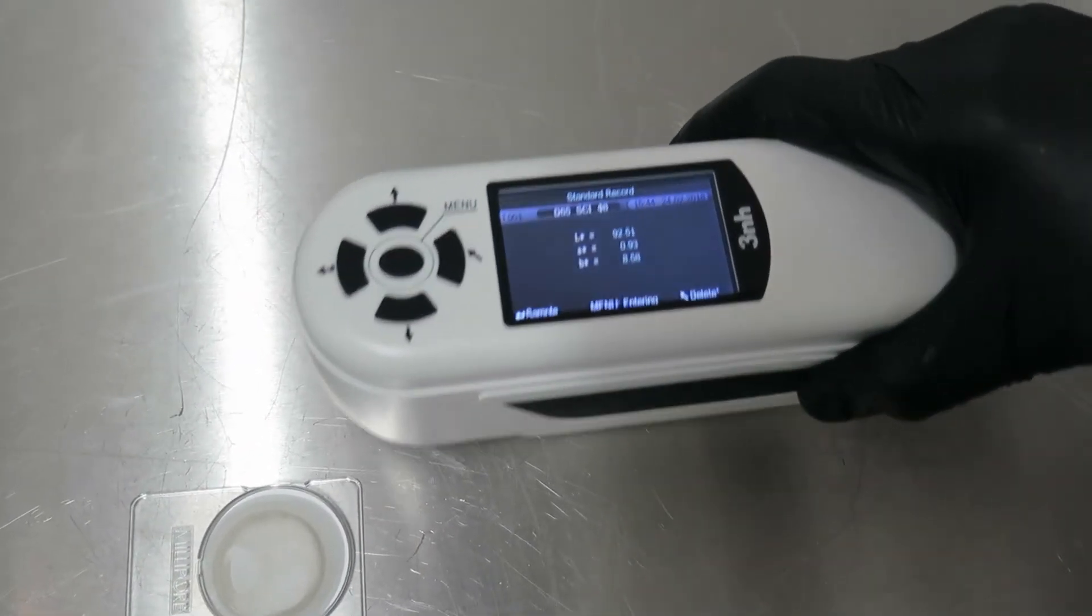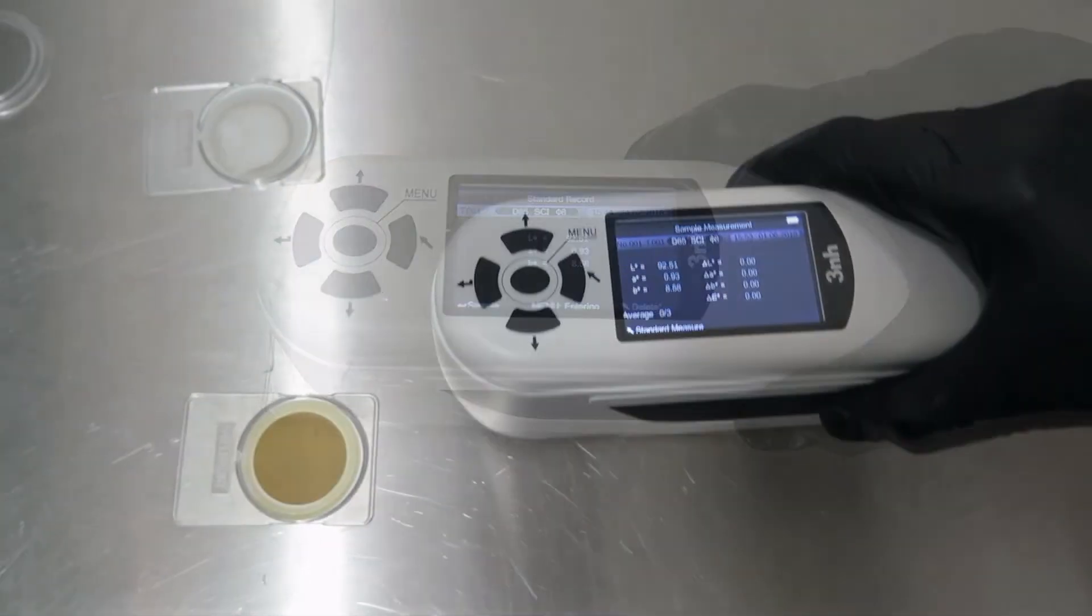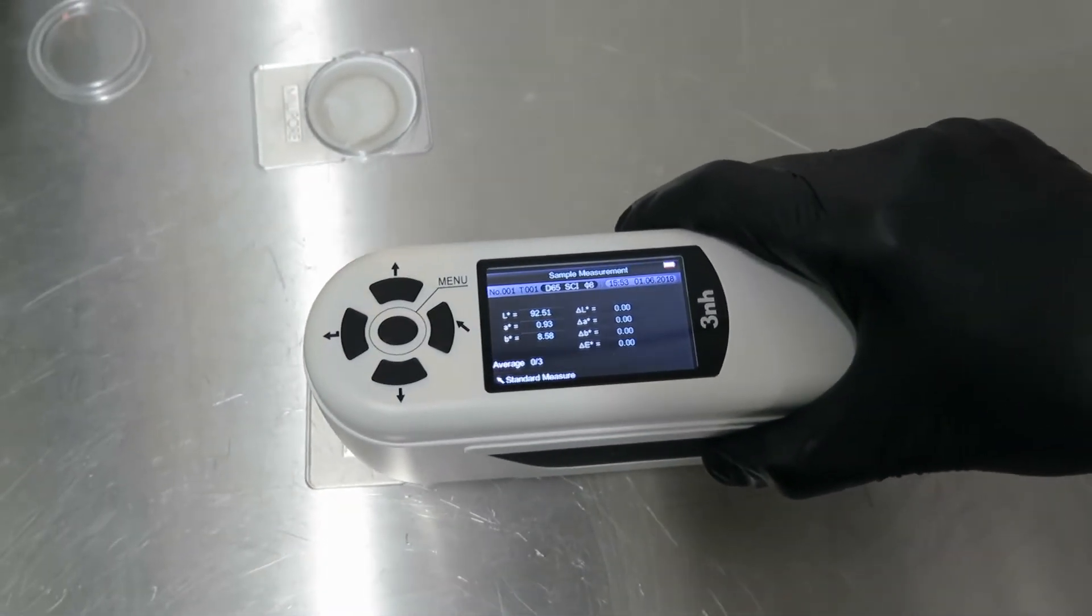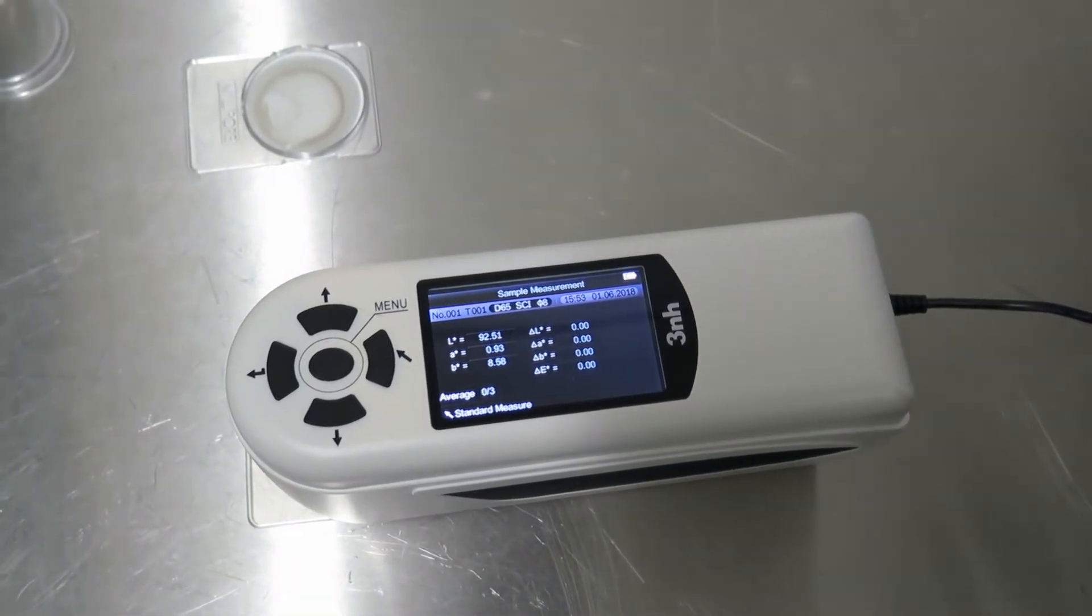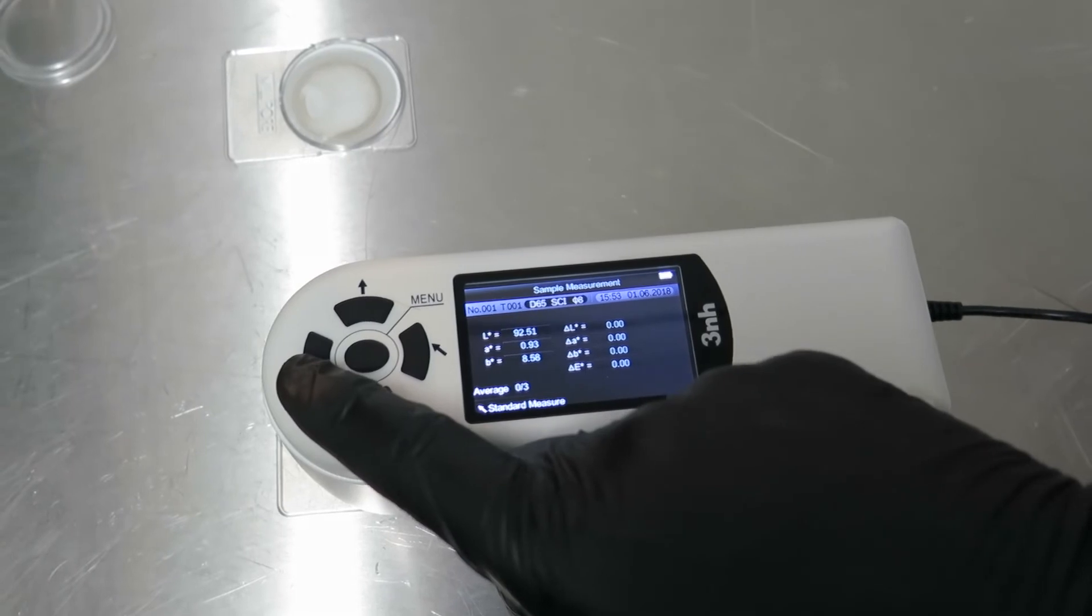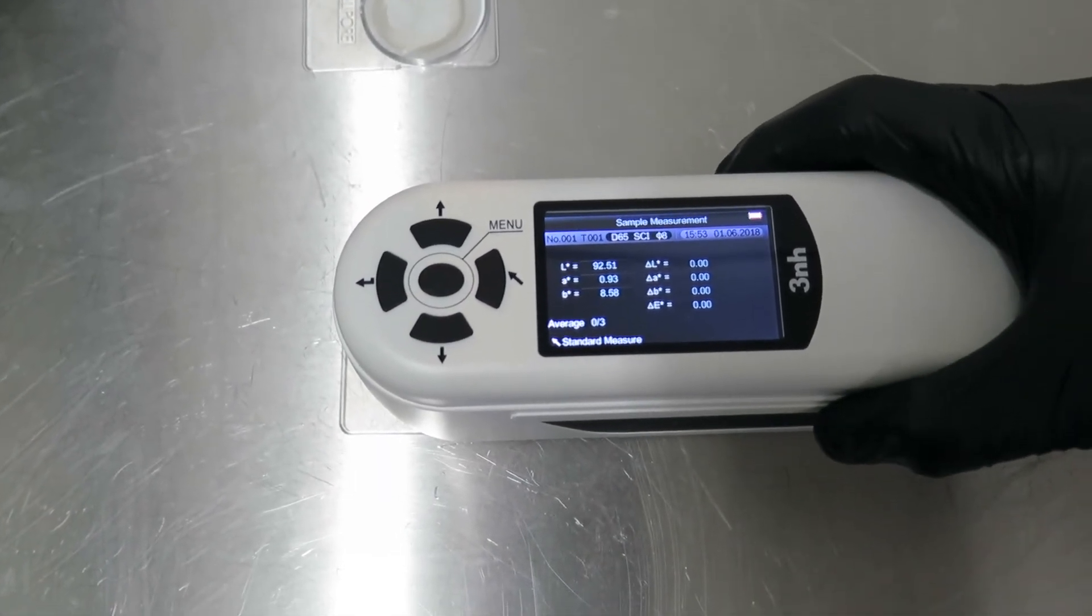Then measure the color of the used oil and reference it against the color of the baseline or standard new oil. This is done by selecting the appropriate parameters within the instrument.